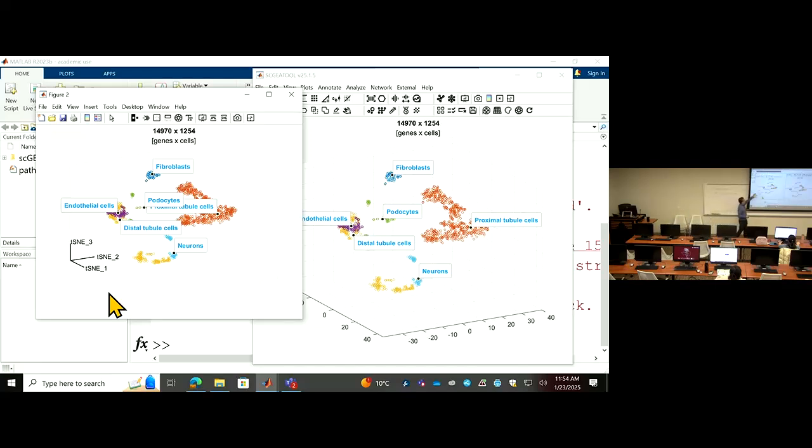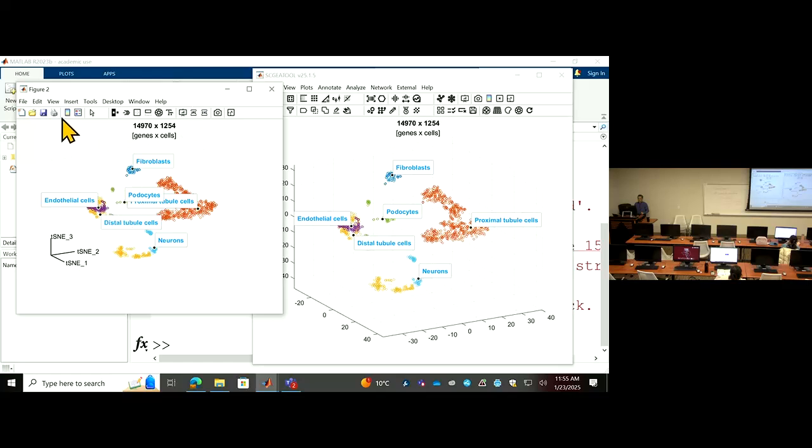Basically, this X, Y, Z axis has no unit. So some reviewers, if they know the algorithm clearly, will see you cannot label any numbers on this t-SNE or UMAP because they are unit free. You shouldn't have that in there. In some cases you want to have a clean plot like this with no label of x, y axis. So this will be ready for the publication.